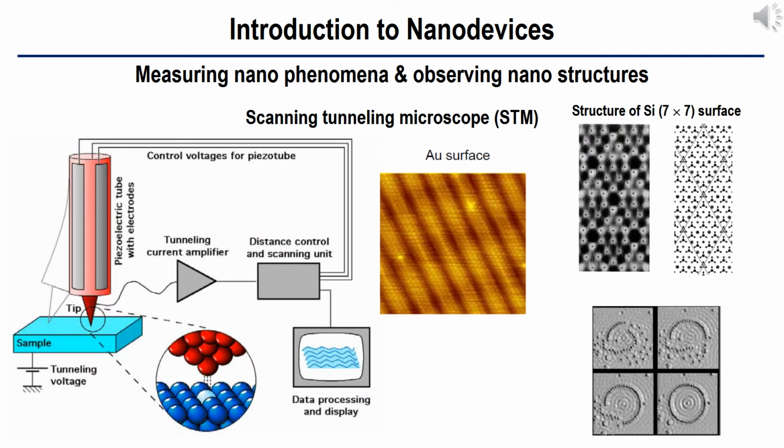The first scanning probe microscope is the Scanning Tunneling Microscope (STM). As the name indicates, STM utilizes quantum mechanical properties such as the tunneling of electrons. As many of you have already learned in the quantum mechanics course, quantum tunneling is the quantum mechanical phenomenon where a subatomic particle passes through a potential barrier. Quantum tunneling is not predicted by the laws of classical mechanics, where surmounting a potential barrier requires enough potential energy.